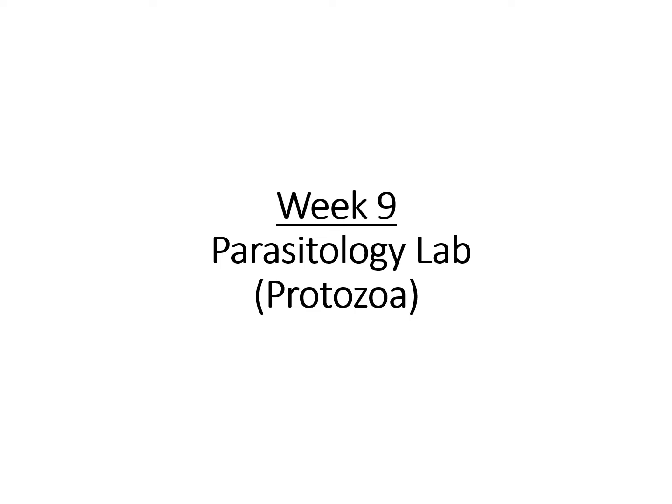Hello everyone. This week we're going to talk about parasitology. We're going to discuss some different protozoa. Some of them are pathogenic, some of them are not, so let's go ahead and get started.